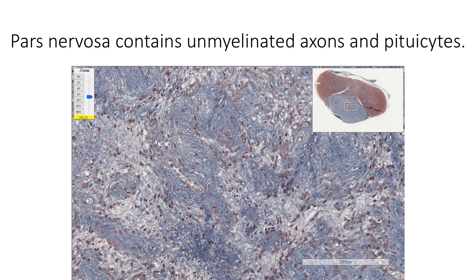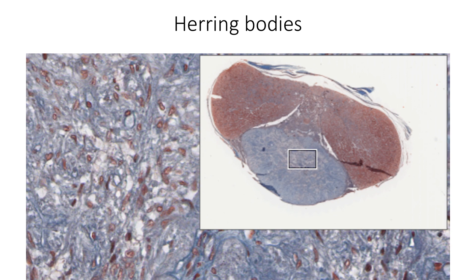Pars nervosa shows unmyelinated axons that form the hypothalamo-hypophysial tracts. These axons end on the fenestrated sinusoidal capillaries of pars nervosa to release their secretions. Pars nervosa also shows supporting cells known as pituicytes, which are modified astrocyte-type glial cells. The neurosecretory vesicles within these axons contain either antidiuretic hormone or oxytocin. These vesicles accumulate within the axons to form dilatations called Herring bodies, which appear as small islands of dark-colored masses or as eosinophilic islands in H&E stained sections.